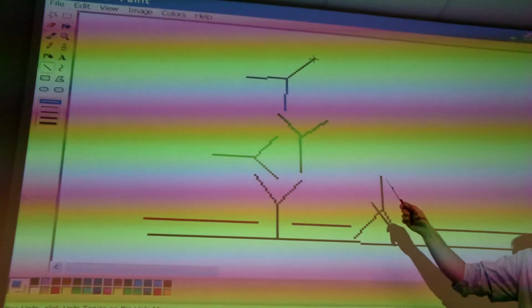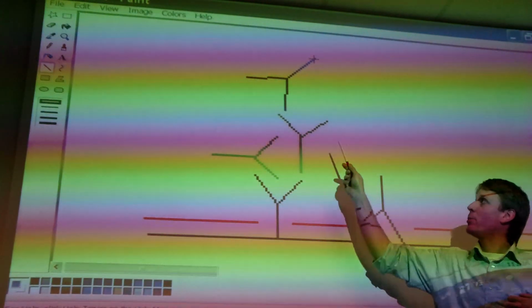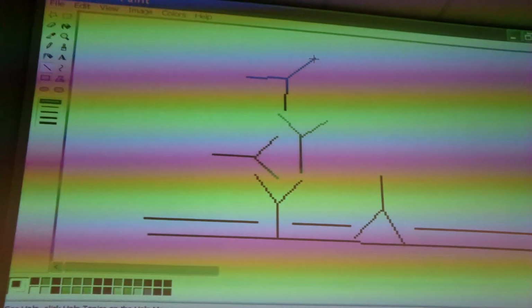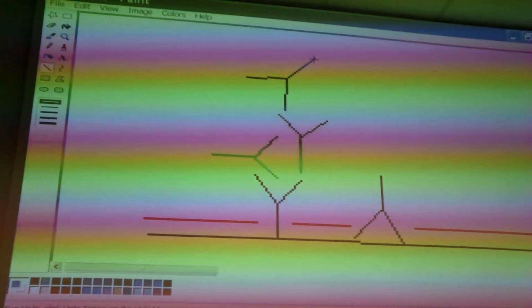For detecting this antibody and this antibody, in principle, it would be good enough to have an antibody that reacts with both heavy and light chains. For instance. It would be better if you made it more specific. I'm going to explain to you. But I'm not sure that I completely understand your idea. Alright. Well, I actually want to point.